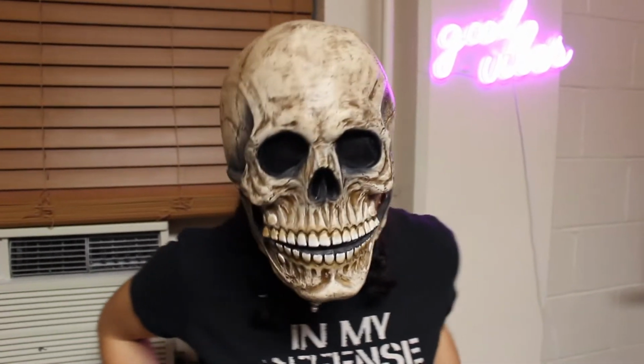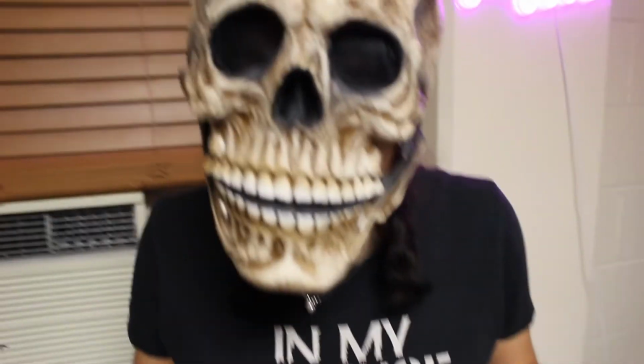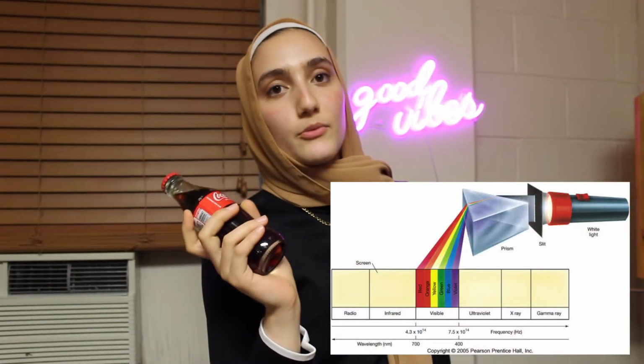Okay, that sounds really cool. I'm intrigued. But what is it specifically used for? Like, couldn't I just use my eyes to look at the wavelengths and tell what the wavelengths are? Well, no, Carly. Wavelengths aren't perceivable to the human eye. A spectroscope is very important and is used specifically by looking through a slit on the spectroscope, and then the prism breaks up the light into different wavelengths.